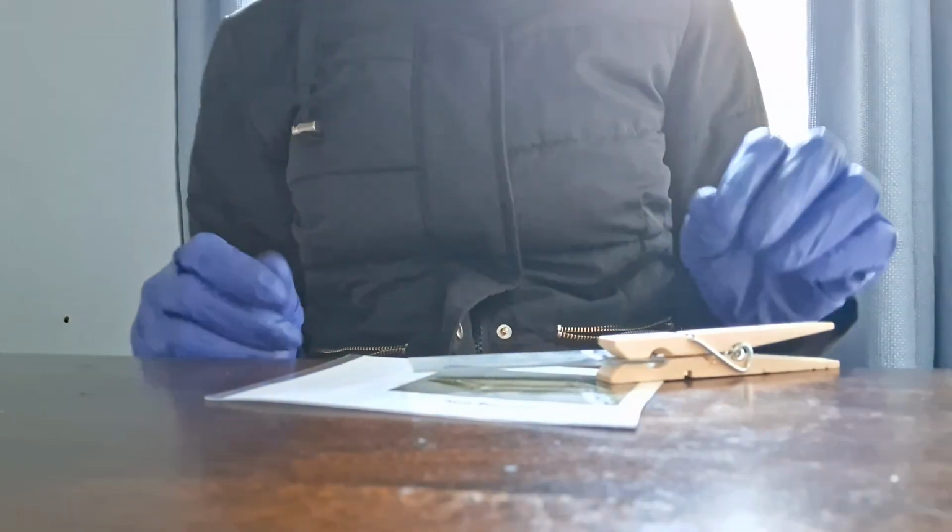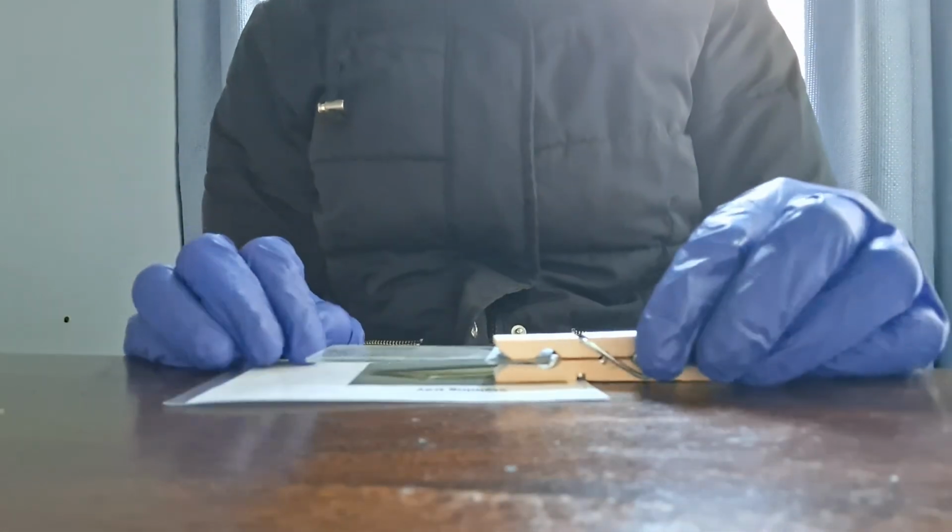After we remove the paper and we are using the staining tray right now, and we've used our water bottle on it, what we are going to do is use the acid alcohol.